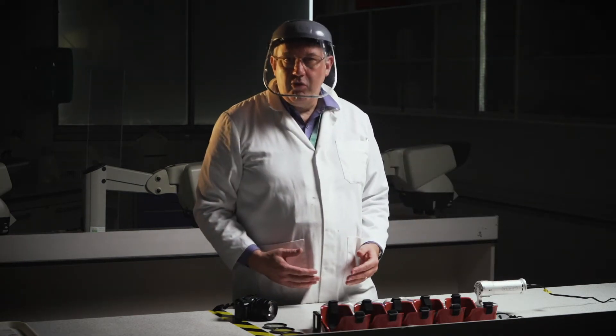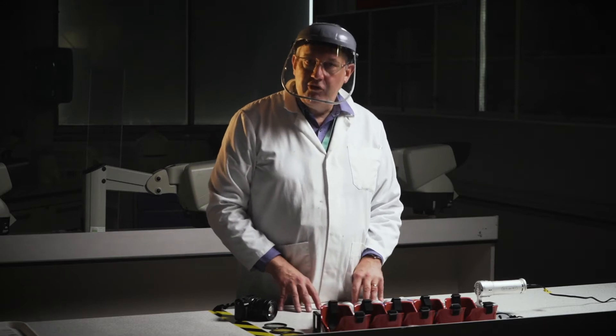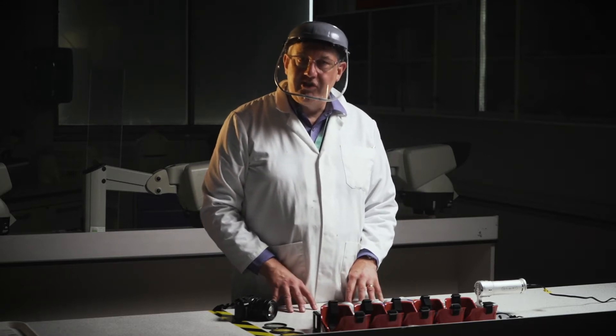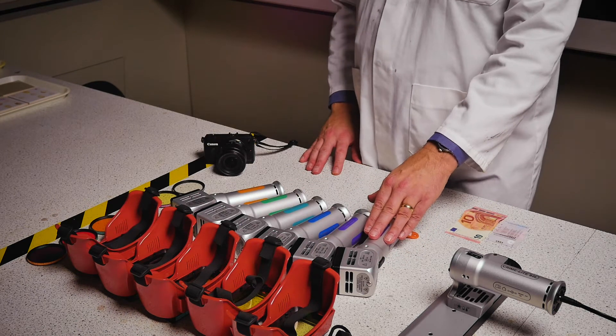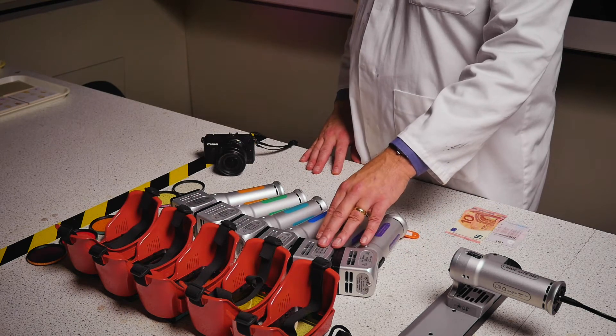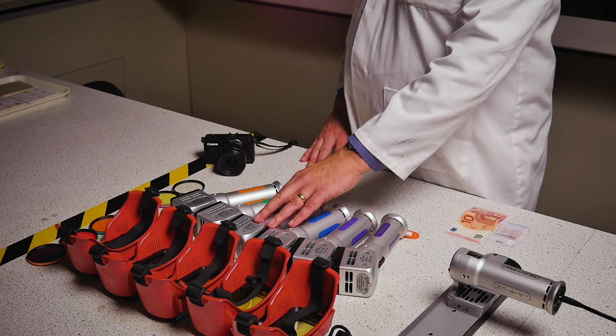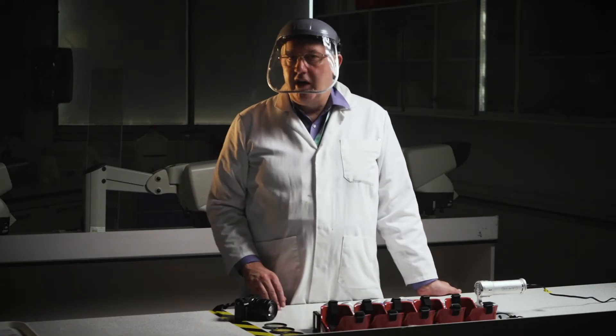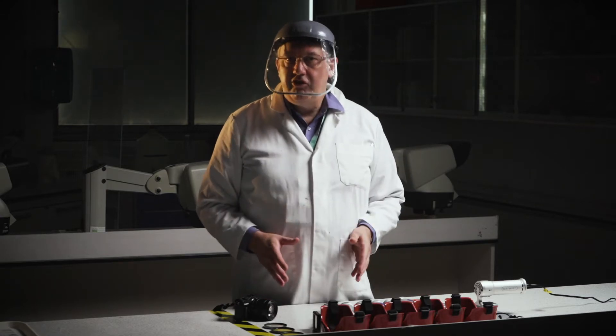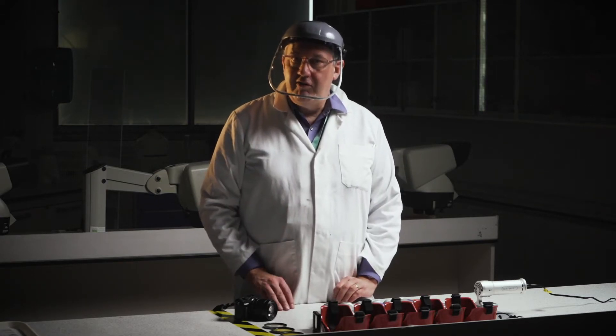But the main focus of this talk is really the colored light sources that we use for different types of fluorescence examination. And we have a range here. We have a range that goes from ultraviolet to violet, blue, blue-green, green and amber. And all of these different colors of light, these different wavelength ranges, will find different forms of forensic evidence.